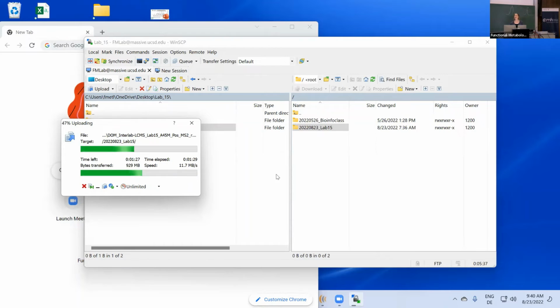Yeah. Oh yeah, there were just a lot of questions popping up in the chat. Oh wow, good idea. Okay, yeah, maybe while this is uploading, we take a break.